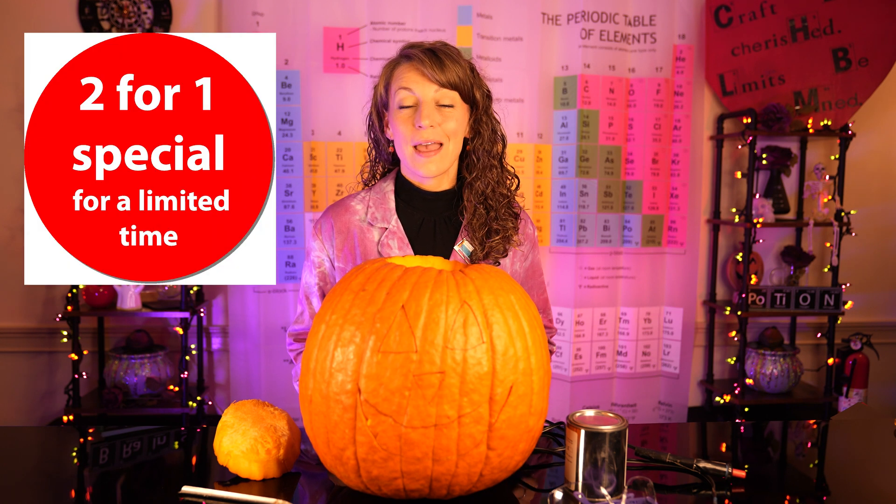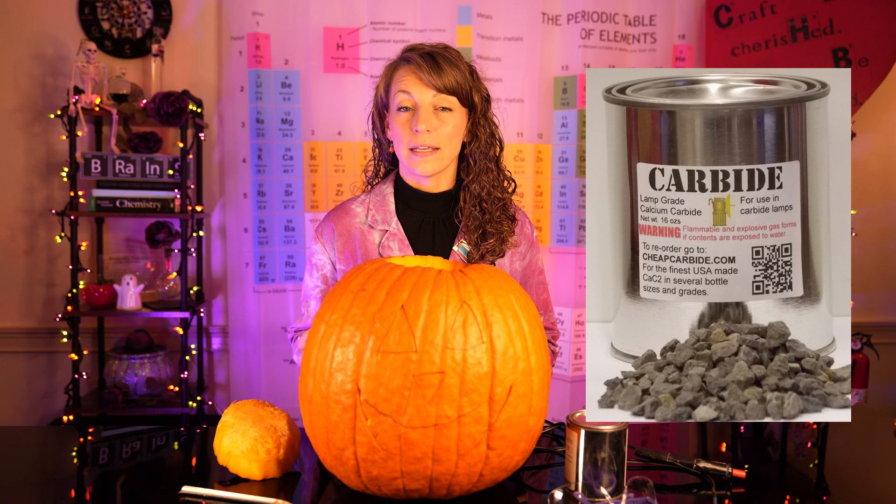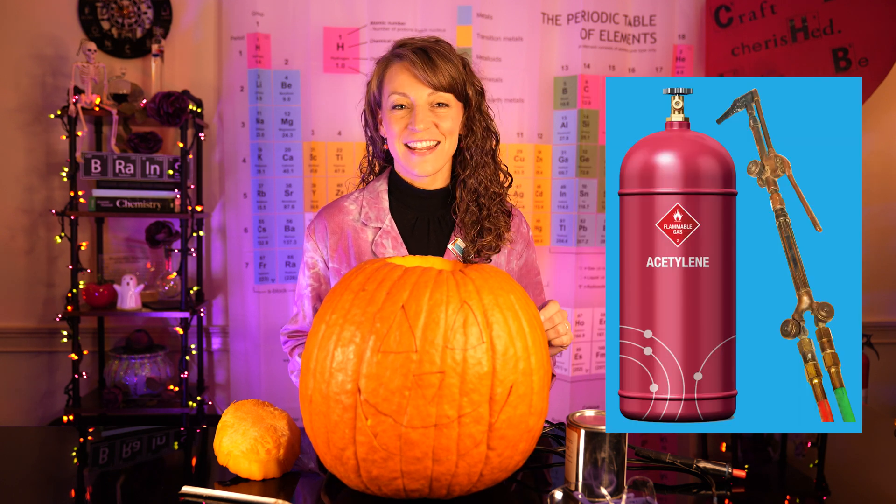In fact, we're going to use not one, but two chemical reactions to carve this jack-o-lantern. The first chemical reaction: we're going to take calcium carbide, a solid, and react it with liquid water to produce a little bit of acetylene gas.